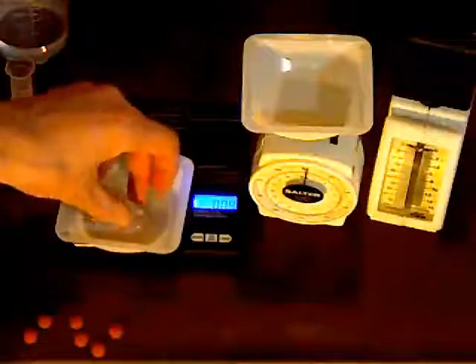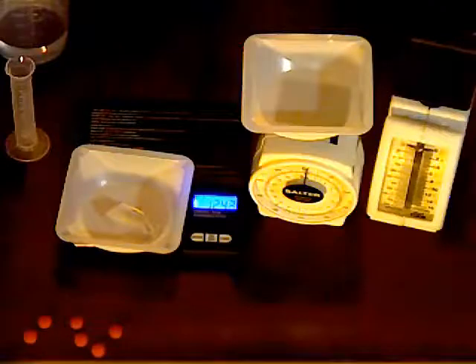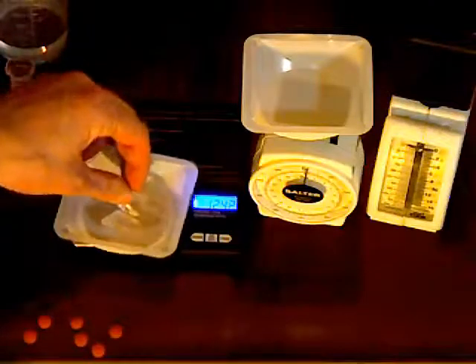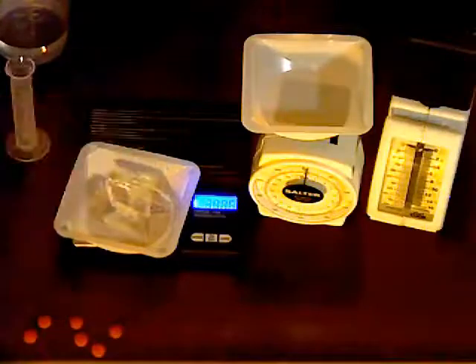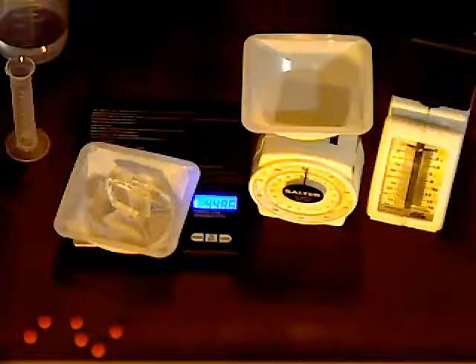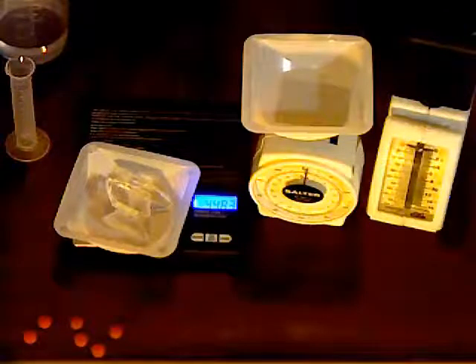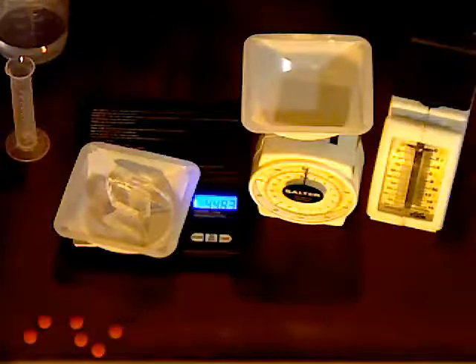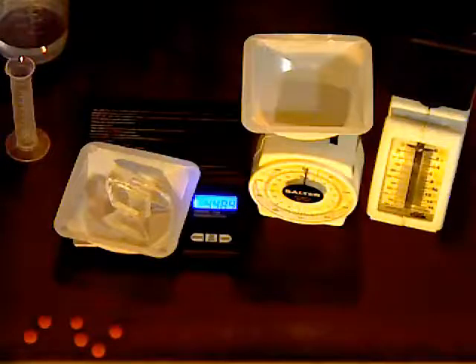I'm going to mass out some larger crystals. So these are some quartz crystals, and they're relatively higher in purity. And if I put 3 on, we get 44.86 grams. This is sufficient to register really well on my other 2 scales.